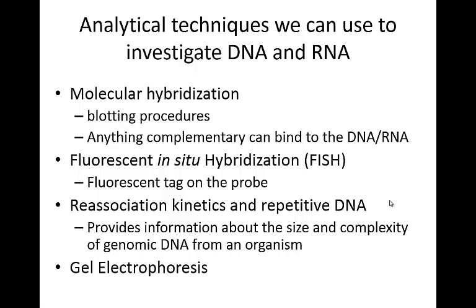And this is called fluorescence in situ hybridization, or FISH for short. Similar process, just a little bit more specialized in the molecular hybridization. Because it's a fluorescent tag, you can literally tag this while it's still in the cell. And so, for example, you could follow the DNA, you can look at the structure, you can look to see if the ends are broken, just by using these different tags.